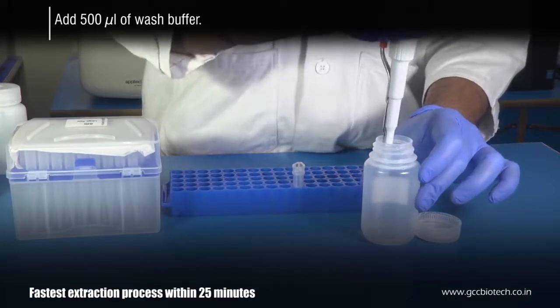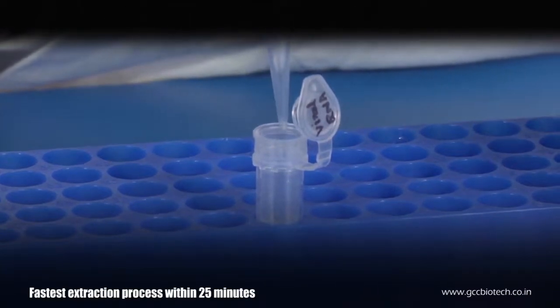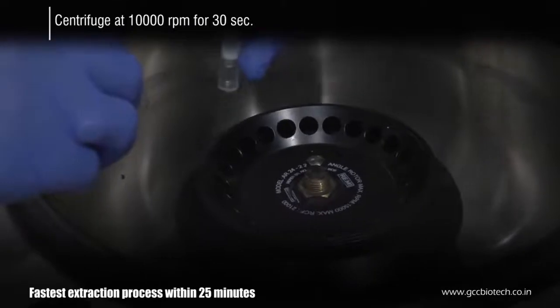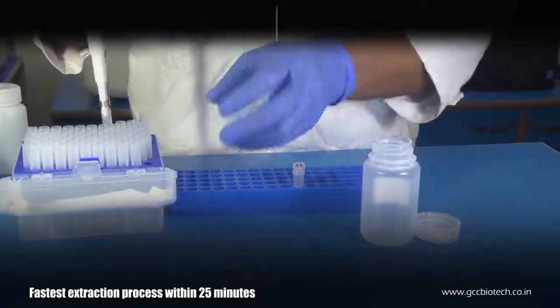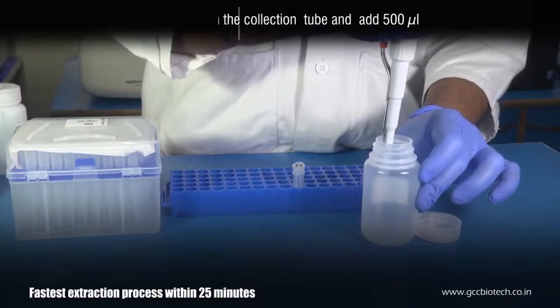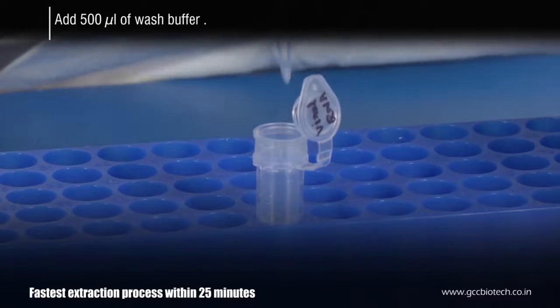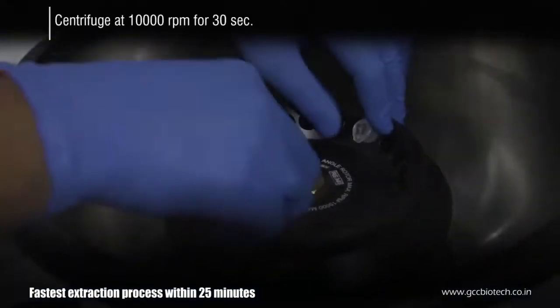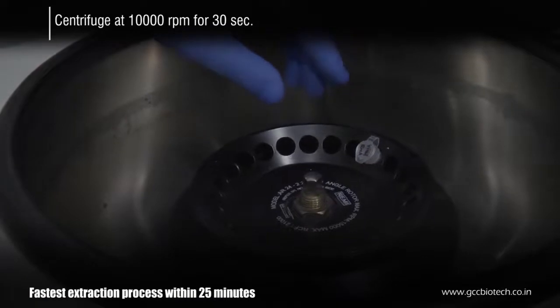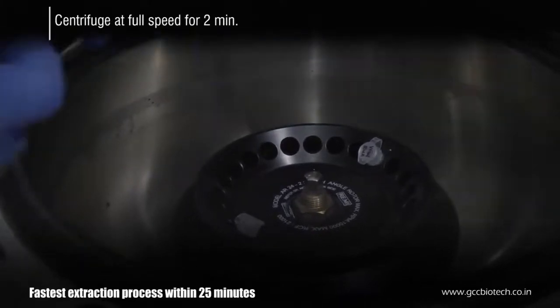Add 500 microliters of wash buffer and centrifuge at 10,000 rpm for 30 seconds. Discard the flow-through and repeat the washing step again. Add 500 microliters of wash buffer and centrifuge at 10,000 rpm for 30 seconds. Then discard the flow-through and spin the empty column at full speed for 2 minutes.